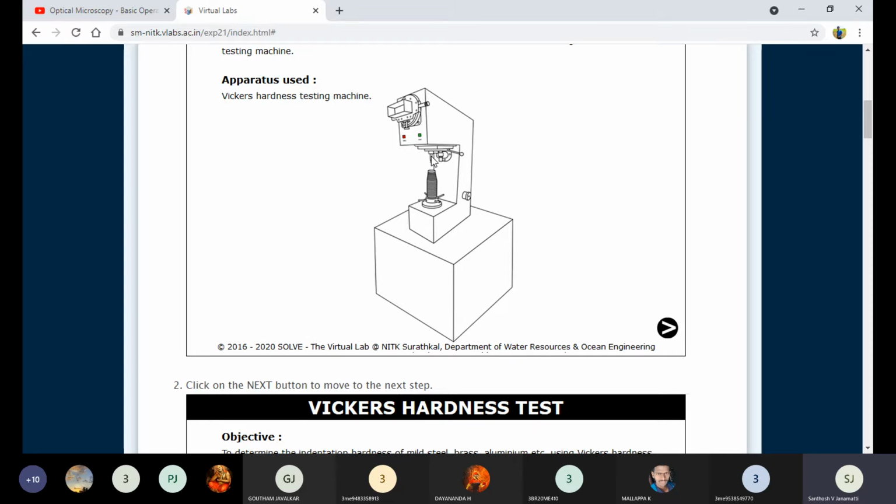Here we can see the indenter holder. Most of the time this indenter and indenter holder are fixed into the machine. The type of the indenter is most of the time a diamond, right? So for that particular angle we are choosing the diamond indenter, and now we are fixing it into the machine. Most of the time it is fixed. Beside this indenter holder, we can see other knobs.